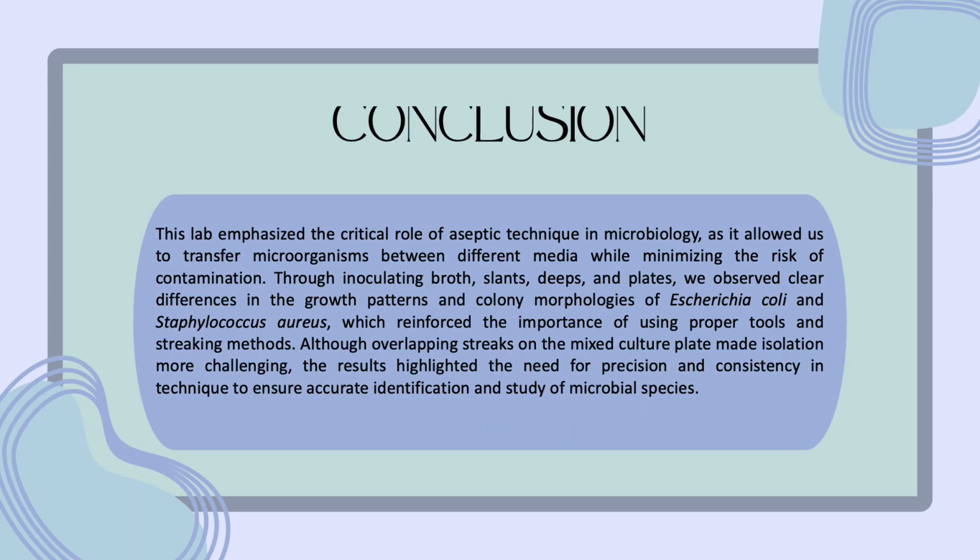So, in conclusion, this lab emphasized the critical role of aseptic technique in microbiology, as it allowed us to transfer microorganisms with different media while minimizing the risk of contamination. Through inoculating broth, slants, deeps, and plates, we observed clear differences in growth patterns and colony morphologies of Escherichia coli, otherwise known as E. coli, and Staphylococcus aureus, S. aureus, which reinforced the importance of using proper tools and streaking methods.